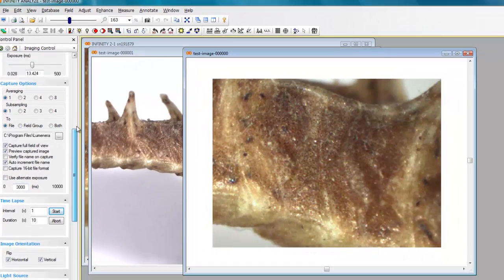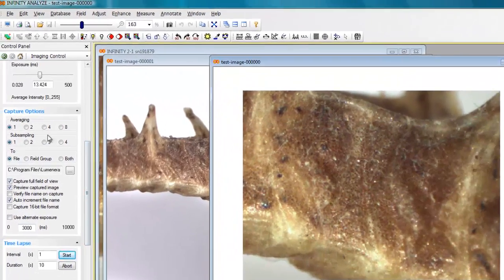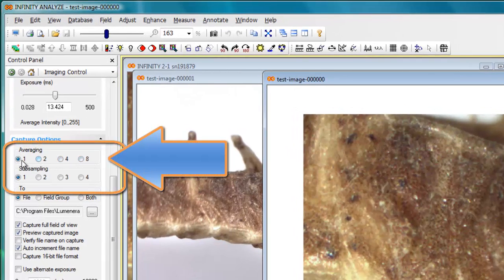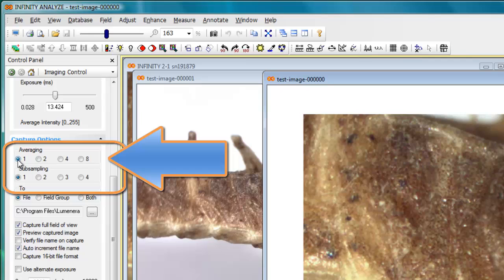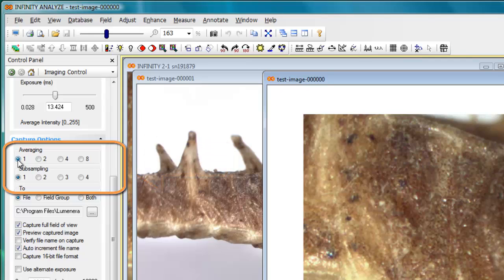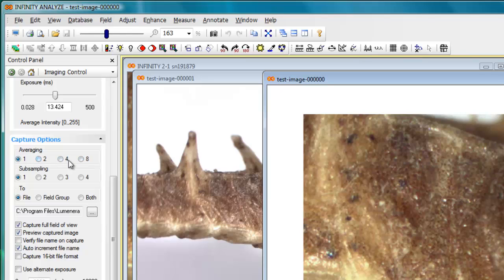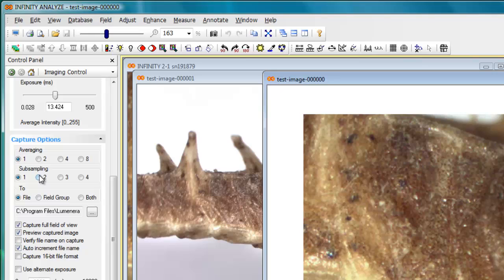Up at the top of the capture options dialog box, I've got a few rows of radio buttons. Averaging allows you to capture an image that's based on a 1, 2, 4, or 8 frame average. If you have a somewhat noisy imaging environment, high gain or longer exposure, and you want to reduce some of the background noise in that image, some of the random noise can be averaged out by selecting an average frame. And by averaging 2 frames, 4 or 8 frames together, you'll get a different result.